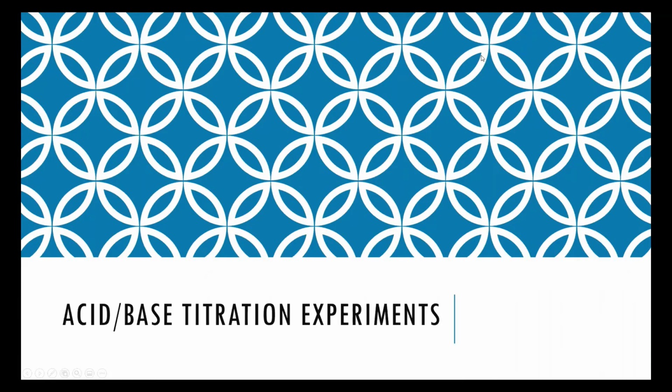In the experiment itself in lab, you're going to be performing a couple of different types of acid-base titrations. In the first part, you're going to be titrating potassium hydrogen phthalate, which is a weak acid, but you're going to titrate a known amount, and using the balanced chemical equation and the known stoichiometric point, you're going to titrate this using an indicator to determine the equivalent weight of your particular unknown sample.